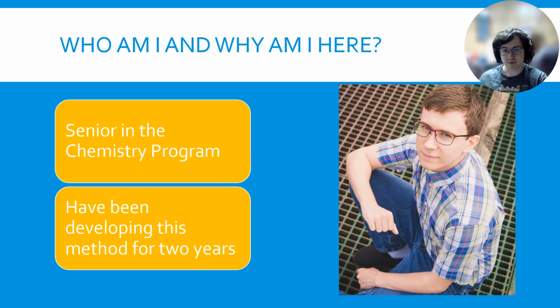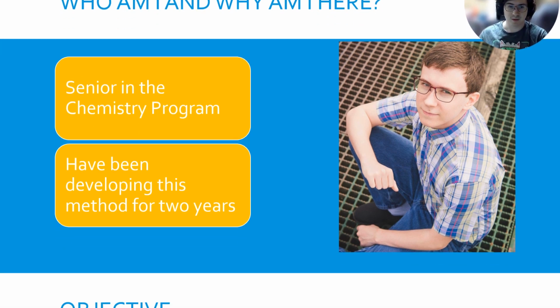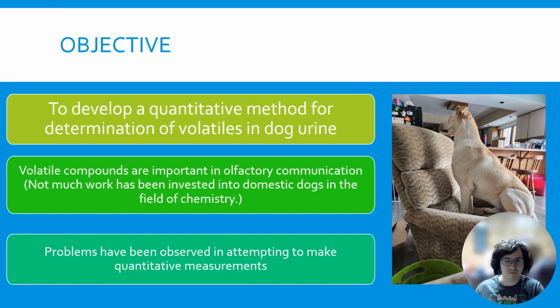My main focus on this project is going to be focusing on quantitative analysis, so turning all of the peak areas and all of our data into usable quantitative data. So the objective is to develop a quantitative method for determination of volatiles in dog urine.